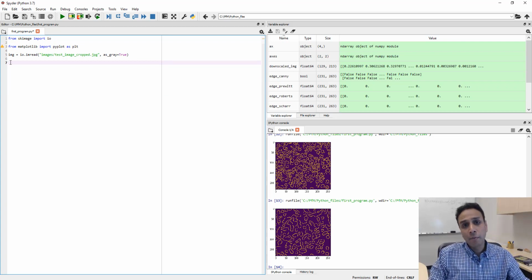And again, if you are coming from a microscopy background, you have probably done deconvolution on your images. From a microscopy point of view, if you look at blurred microscope images, especially blurred light microscope images, there are many reasons why they are blurred, and one of the reasons is the light itself.